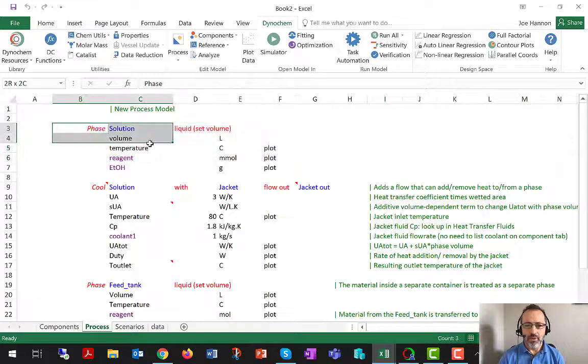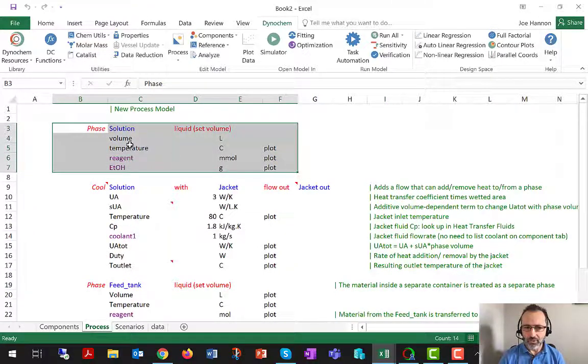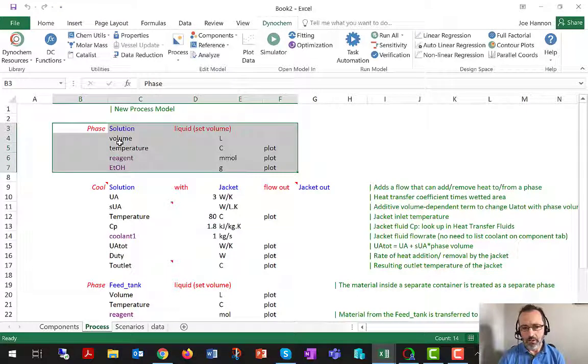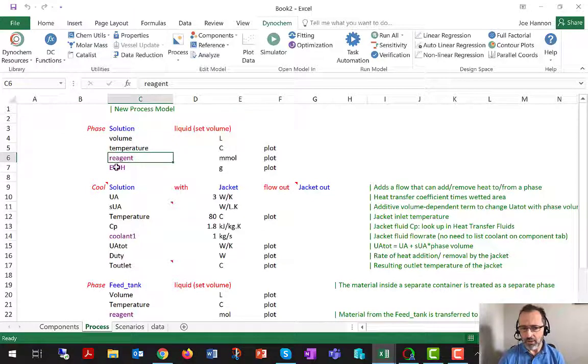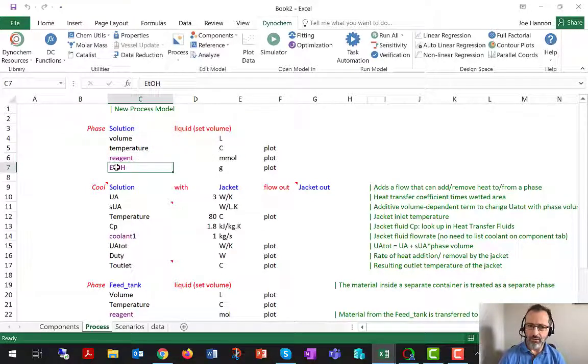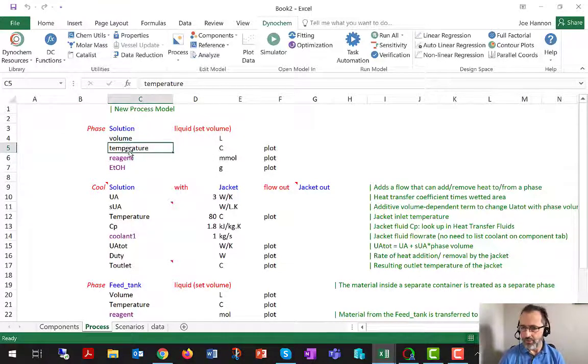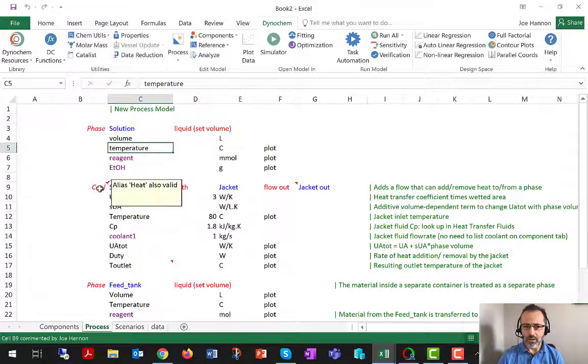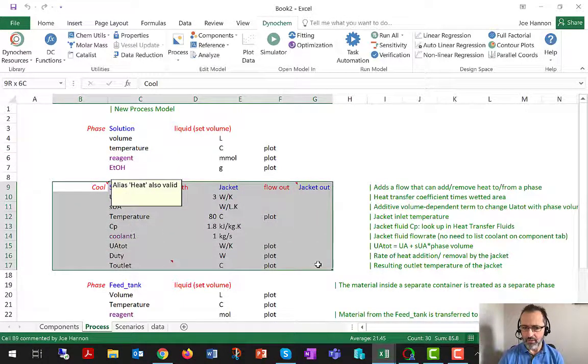Just from a mathematical point of view, you could see the phase paragraphs as representing the left-hand side of the ODE. So d_reagent/dt, d_ethanol/dt, d_volume/dt, d_temperature/dt, and you could see the other statements as representing the right-hand sides.